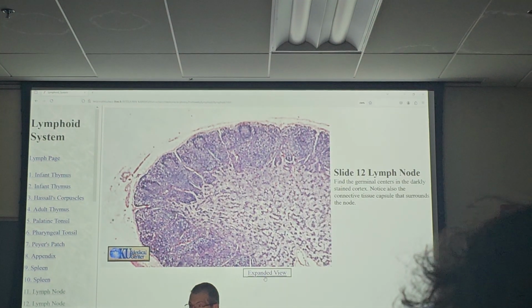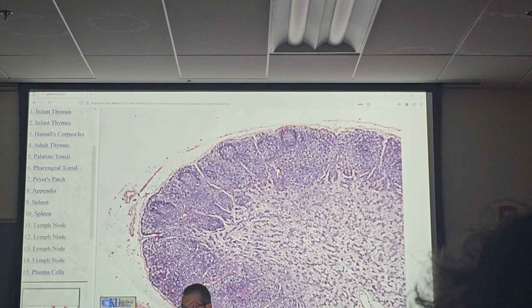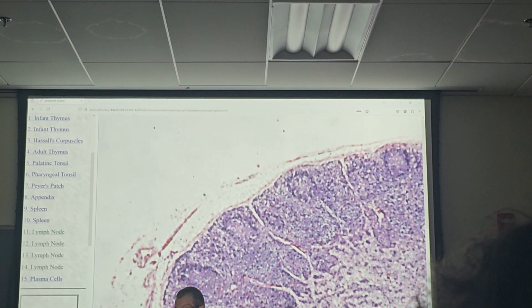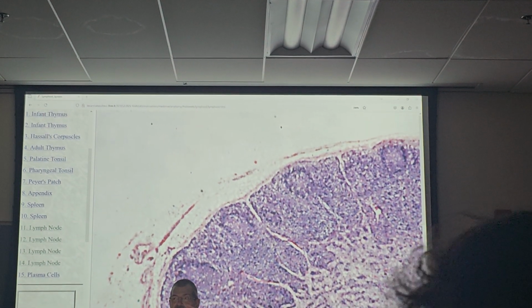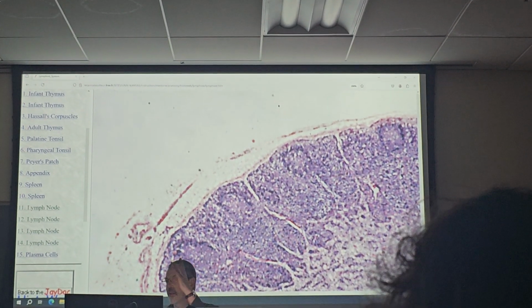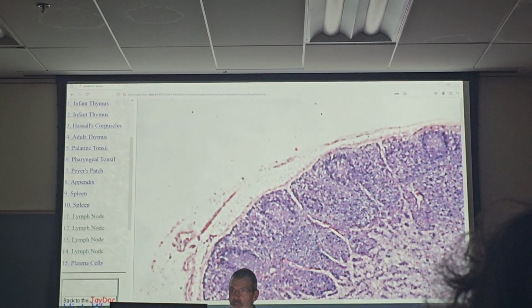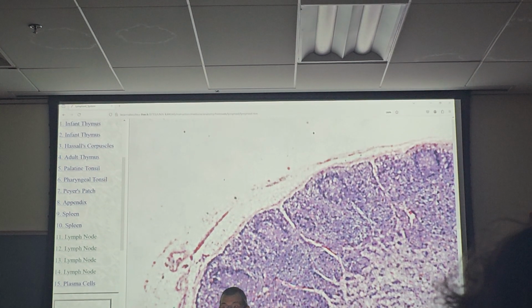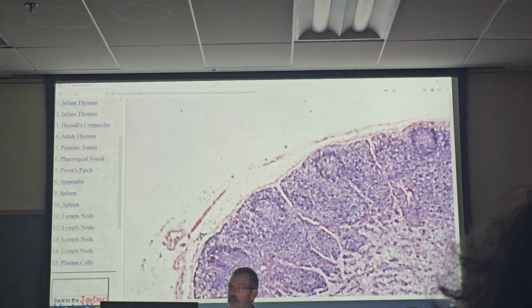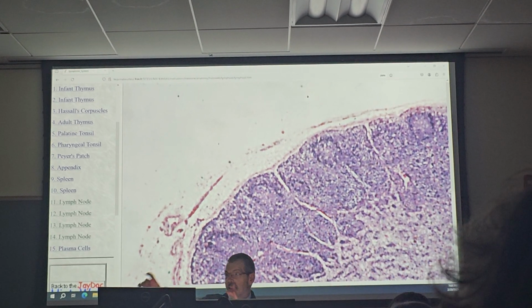If I zoom in on that, a little more. I can't. There you go. If I look right there, that circle is called a nodule. A circle in the darkness. Don't ask me why. That's called a nodule. What do you think we call the lighter center of the circle that is the nodule? That's the germinal center, because we're biologists. The center of the nodule is a germinal center. The nodule is the ring. The darkness is the layer.